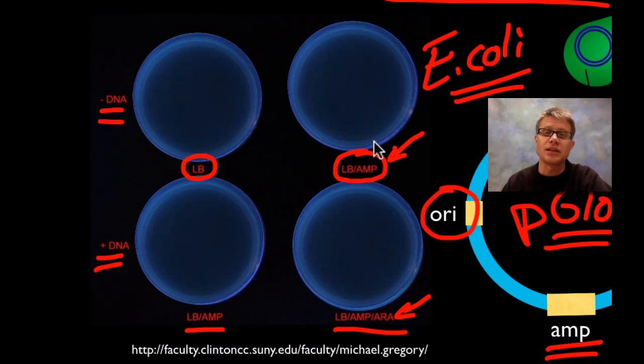And when I do this in class, it's 2 or 3 groups out of 20 or 30 groups. We'll actually get it to transform. And so there's a lot of chance to that. But if you get one bacteria to pick it up, you can get a colony of that, and then it's going to grow. And so basically, let's kind of talk through it.